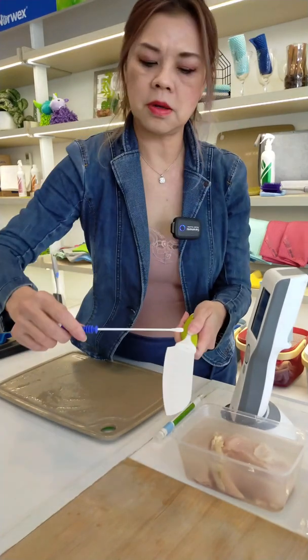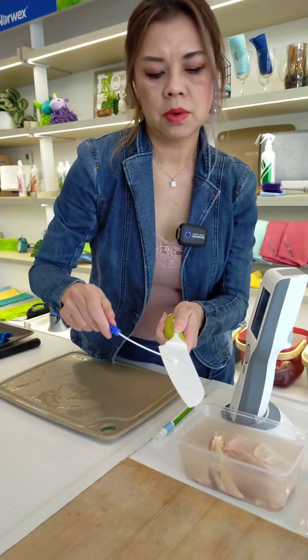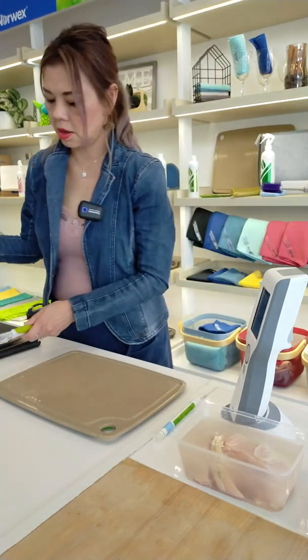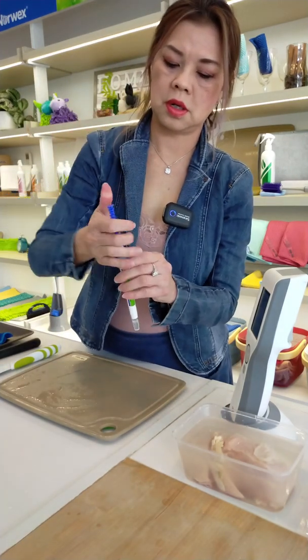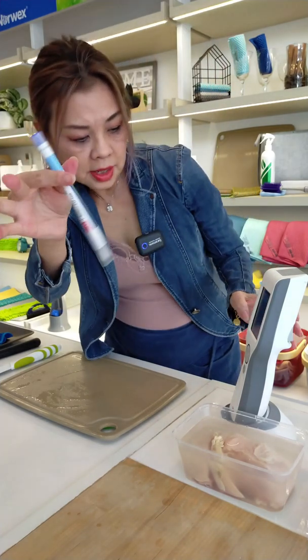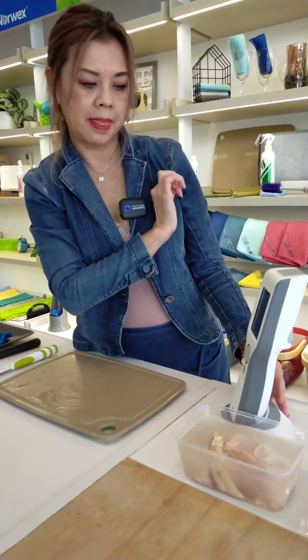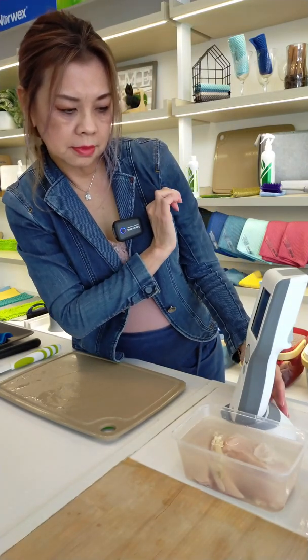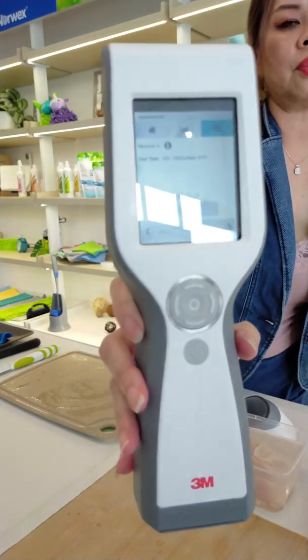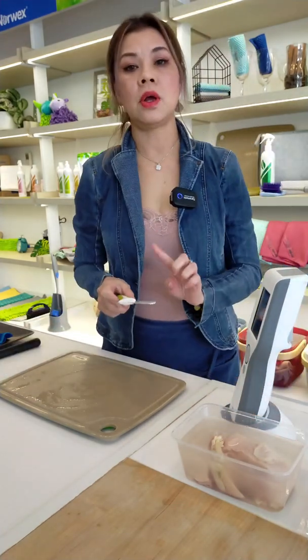I'm going to do the same wipe. There it goes, let's start. Very impressive too — it got it down to 80 RLU.